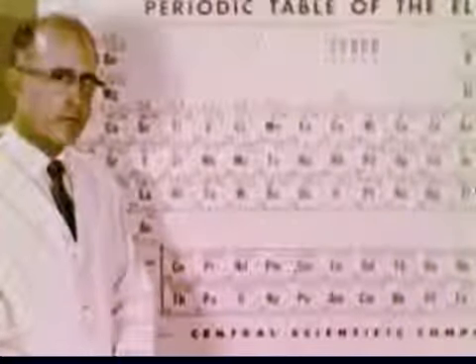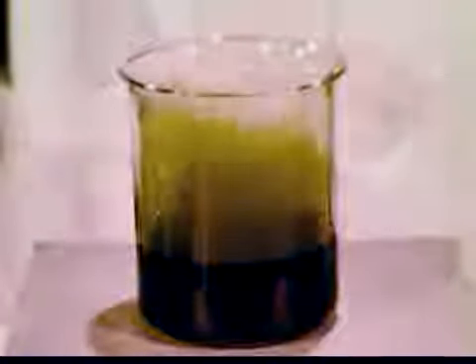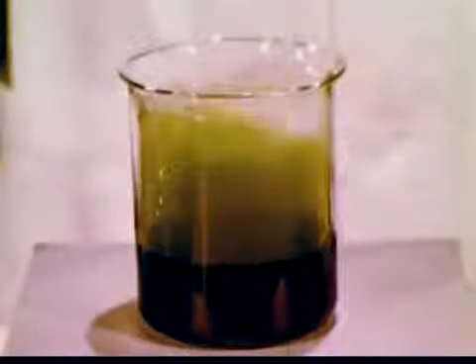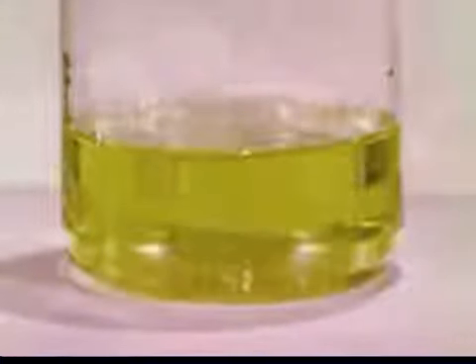The metal reacts with the nitric acid and dissolves. The presence of brownish nitrogen dioxide fumes shows that nitric acid has been reduced and the vanadium oxidized. When the reaction is complete, the solution contains vanadium in its highest oxidation state. Other experiments show that this vanadium is in the 5+ oxidation state.